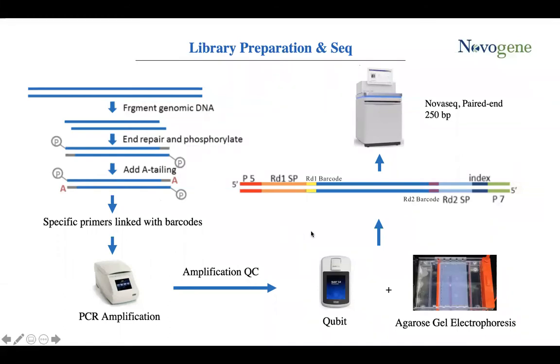And the next step, we ligate the amplicons with the indexed Illumina adapters to go sequencing. So in 16S, 18S, or ITS amplicon sequencing, NovaSeq 6000 is used for this service. And the strategy we apply is the paired-end 250 base pairs.